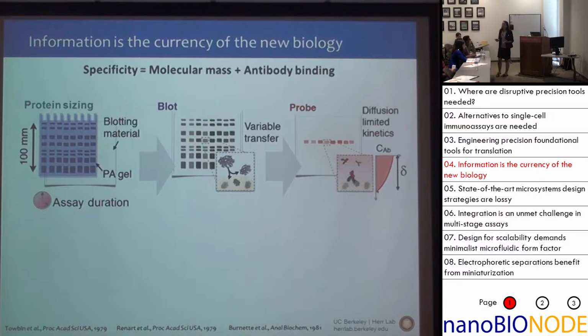And a really powerful way to do that is to, in the case of the single cell, lyse the cell, break it open, and then use something that's called electrophoresis to resolve the proteins or separate them based on differences in size. How many people here have ever done polyacrylamide gel electrophoresis, agarose electrophoresis? Could you raise your hand really high for that one? Okay, so quite a few people actually have.